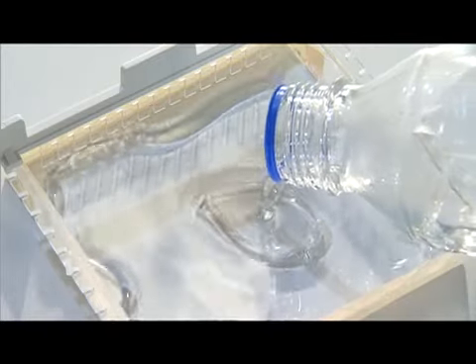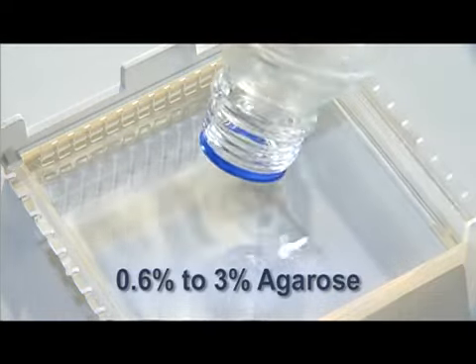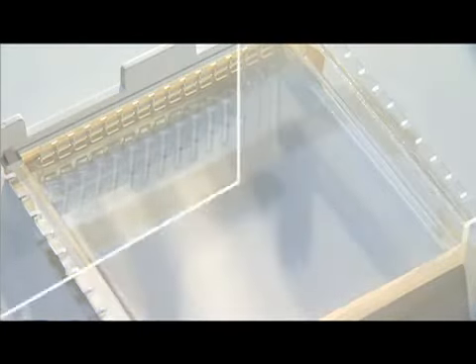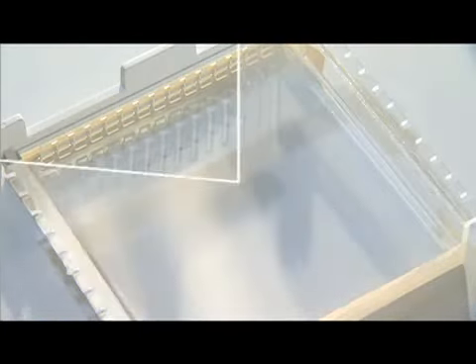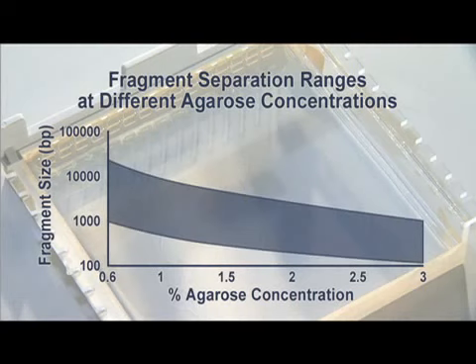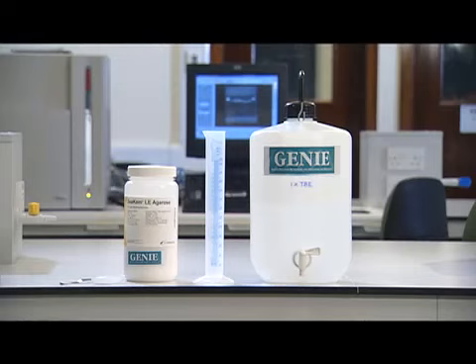Agarose gels can be made with varying concentrations of agarose, between 0.6% and 3% depending on the size of the fragments you wish to separate or resolve. Smaller fragments are resolved better in a gel with a higher percentage of agarose, and larger fragments are resolved better in a gel with a lower percentage of agarose. There are two basic components to an agarose gel: the agarose, which is a white powder, and a buffer solution. These need to be heated together to make the gel.